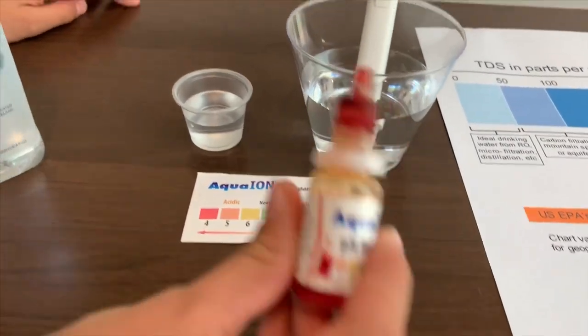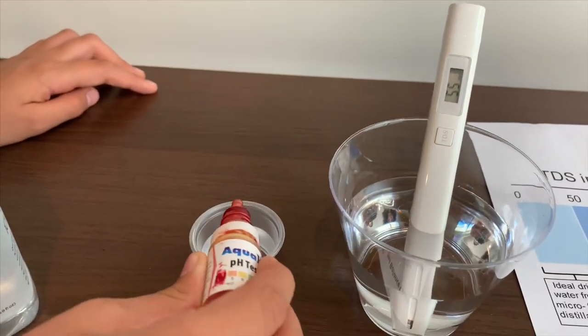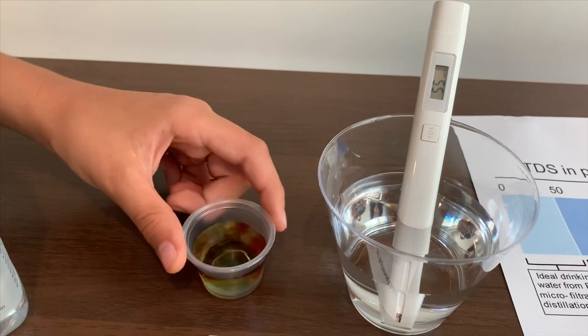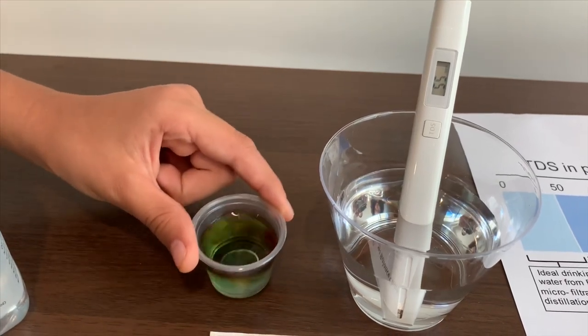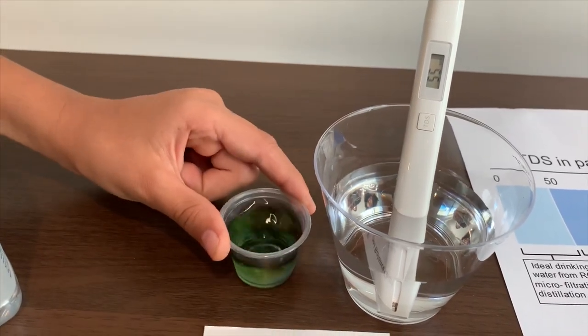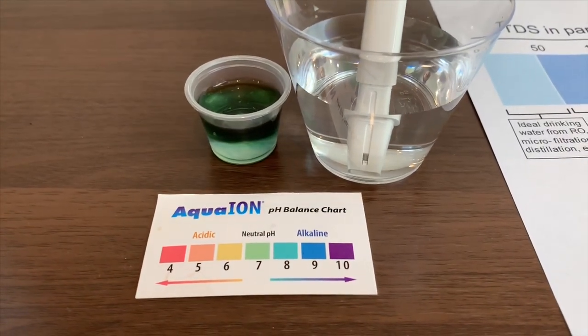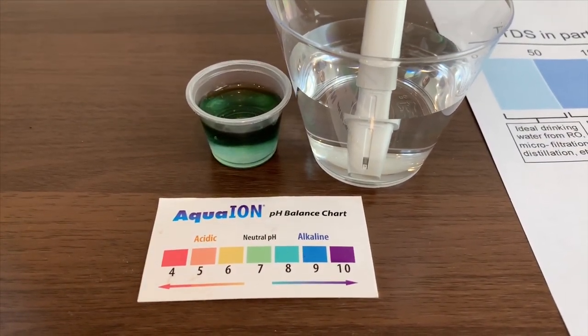Now let's test the pH level. Two drops on. It is an 8.4.